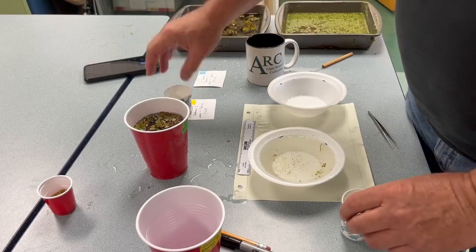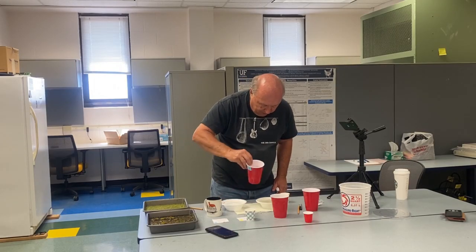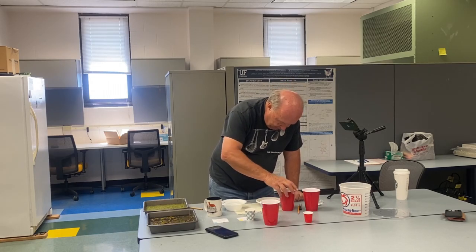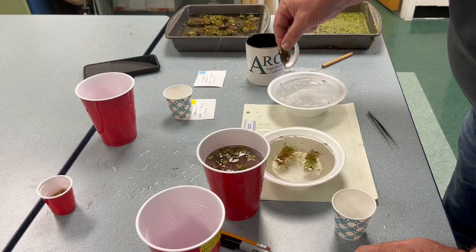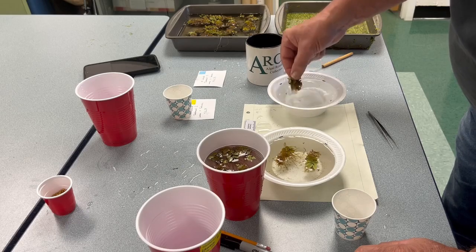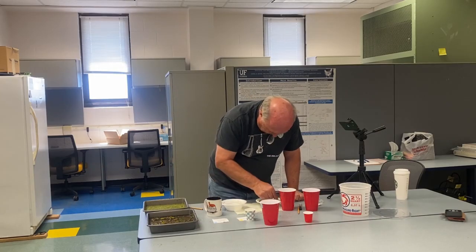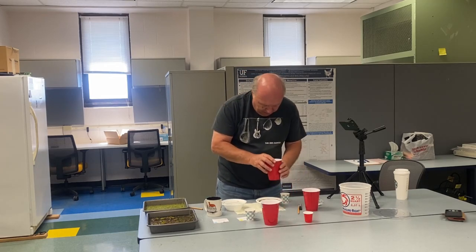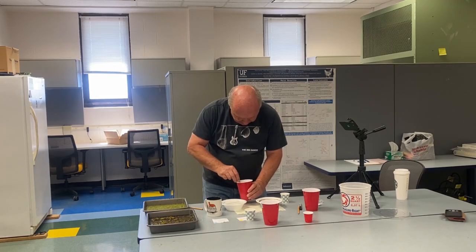And so the reverse of this consists of putting water in your trays like before, and then taking your duckweeds out carefully, and pull out your Lemna and dunk it in here, and dunk the Salvinia in here, to rinse off any of the Lemna. Okay, and then when you take this down, you'll take another photo just like the previous one, and we'll compare them to each other, and those will be our results.